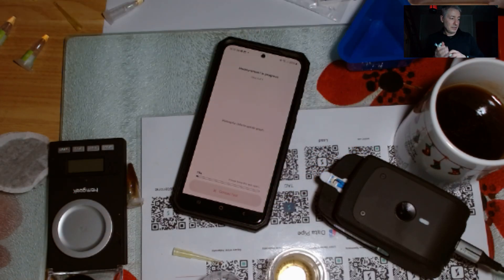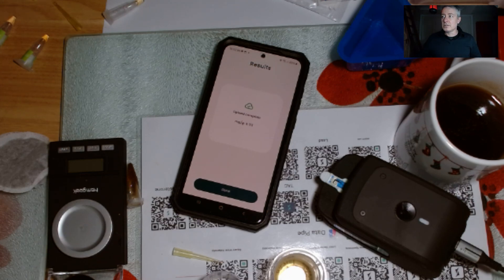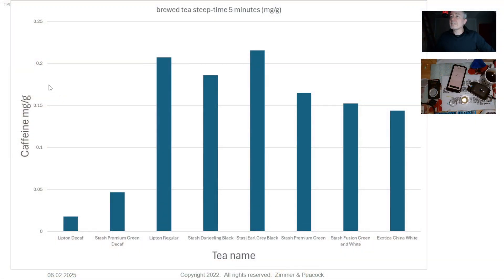I'll hit 'Start Measurement' and it's gathering the data as we speak. It will do the analysis and then I'll get the result for how many milligrams per gram of caffeine is in the drink after the tea leaves have been extracted. I got a result of 0.173 milligrams per gram. Let me share my screen — we got 0.173, which puts us in the range of 0.15 to 0.2 milligrams per gram among teas. I'll put a link to this data underneath the video.